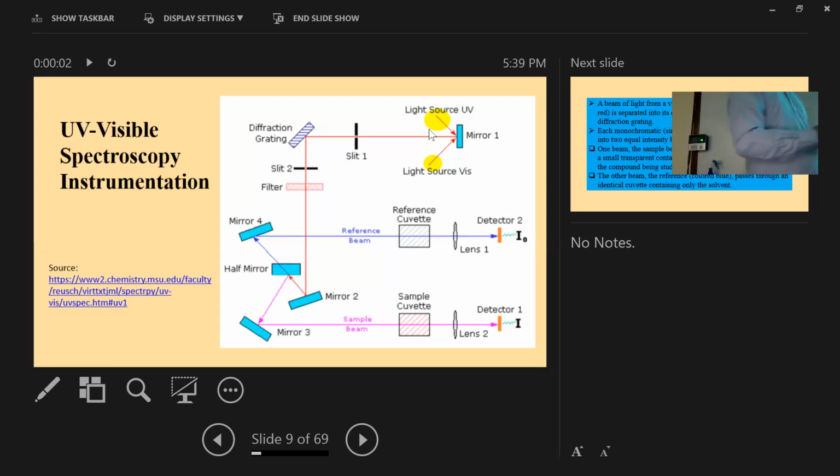In this region we can have a very wide light, but if we put a very small hole or gap, the rest of the light is blocked.